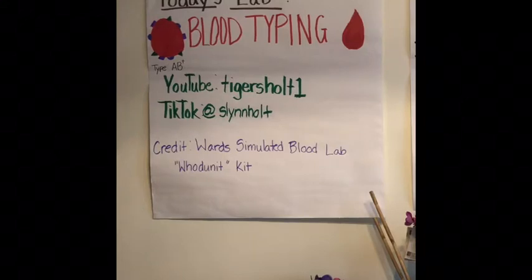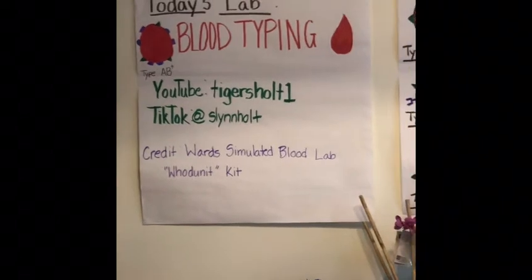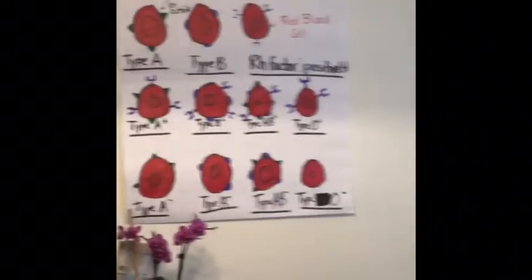I also want to make sure that I give credit to the Ward's Simulated Blood Lab Whodunit Kit, because if you are a teacher and you want to do this lab with your students, you want to make sure that you use the Ward's Simulated Blood Lab so that you can get all the materials that I have in front of me today. So we're going to start out with a quick lesson about blood types.